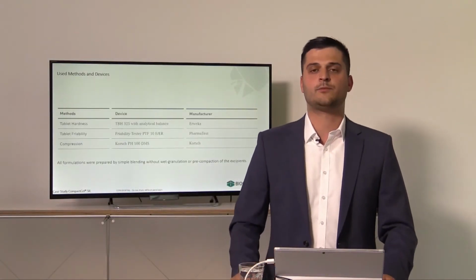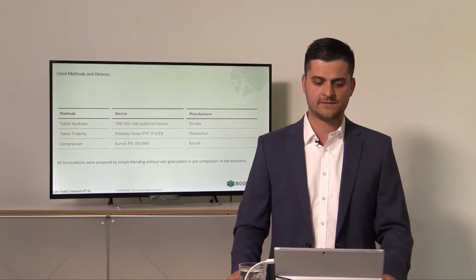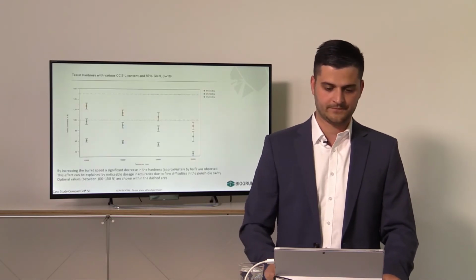The formulas were prepared by simple blending without wet granulation or pre-compaction. This is an important fact to keep in mind. For the tablet hardness, we used an Erweka device. The friability was tested by a Pharma Test, and the tablets were produced by a Korsch rotary tablet press.